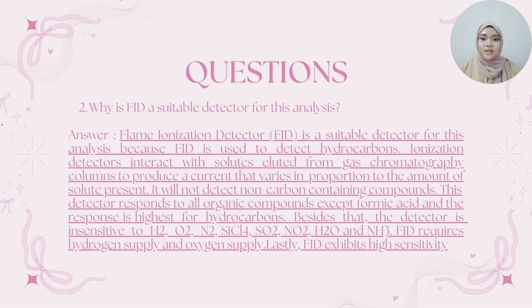Second question, why is FID a suitable detector for this analysis? The answer is that the flame ionization detector, FID, is a suitable detector for this analysis because FID is used to detect hydrocarbons. Ionization detectors interact with solutes eluted from gas chromatography columns to produce a current that varies in proportion to the amount of solute present. It will not detect non-carbon containing compounds. This detector responds to all organic compounds except formic acid, and the response is highest for hydrocarbons.